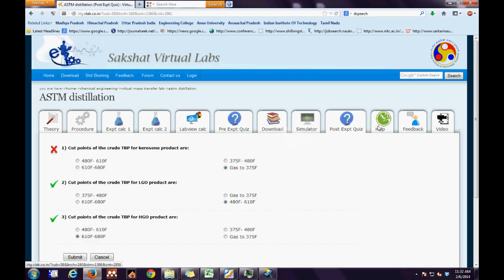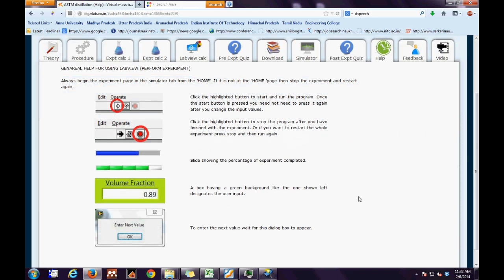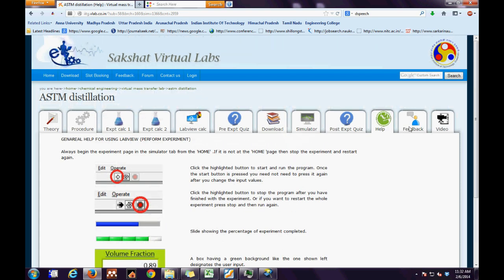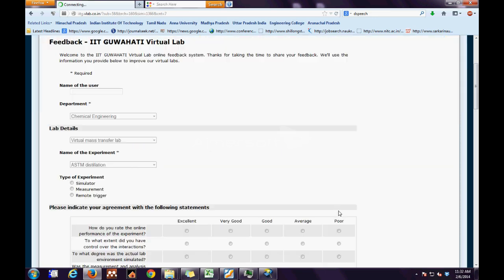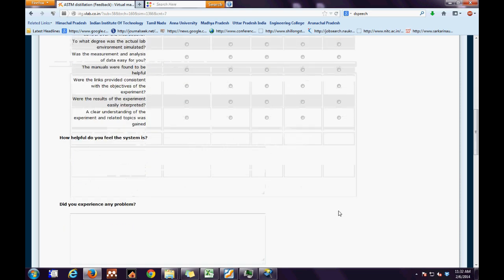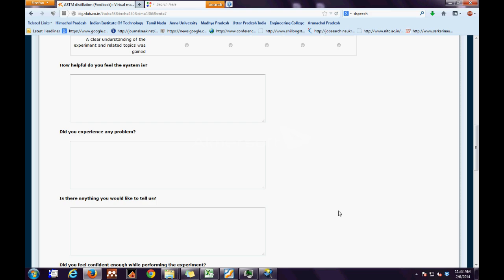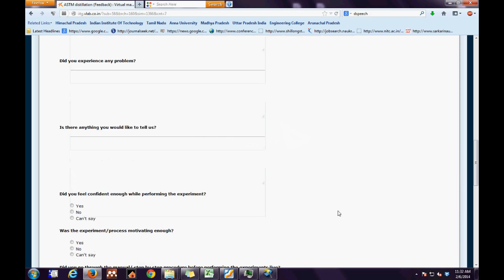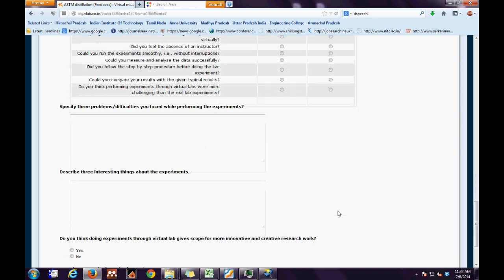The next is the help file, which gives us some simple instructions as to how to operate the simulator. Next is the feedback tab. This tab enables the user to share his or her experience, both good and bad, with the developer. All the user has to do is answer all the questions and then press the submit button at the end of the page.